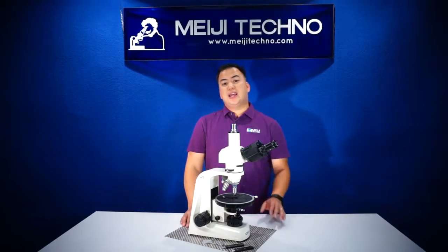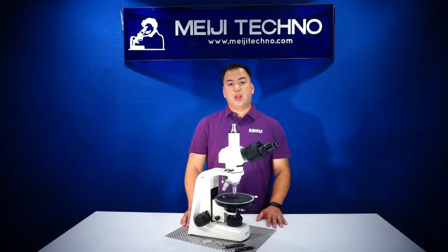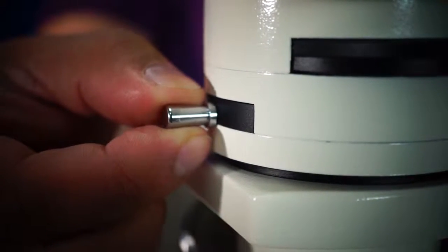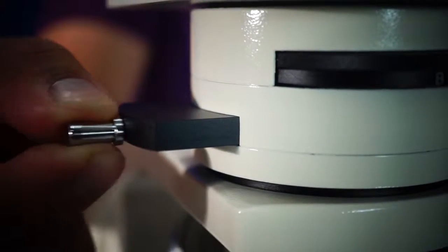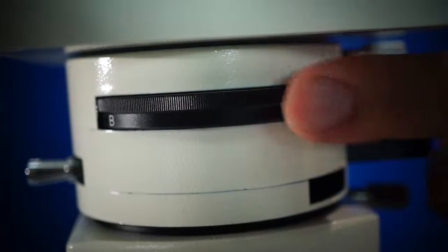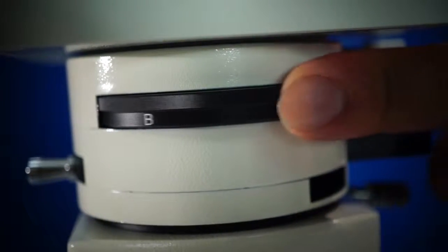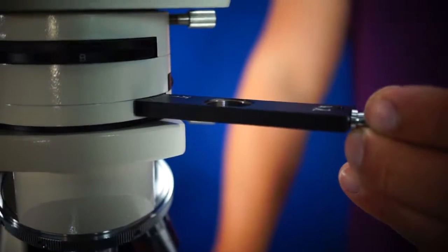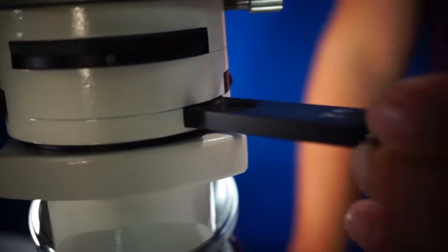Below the head, the MT-9000 series is also equipped with an orthoscopic or conoscopic intermediate tube with a sliding analyzer, a rotatable Bertrand lens, and a compensator slot designed to accept DIN standard compensator plates.